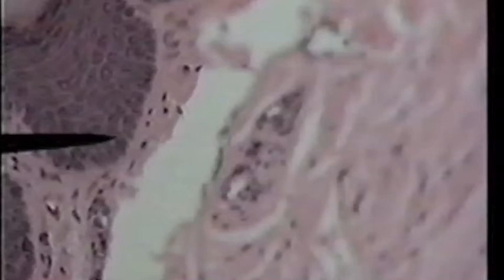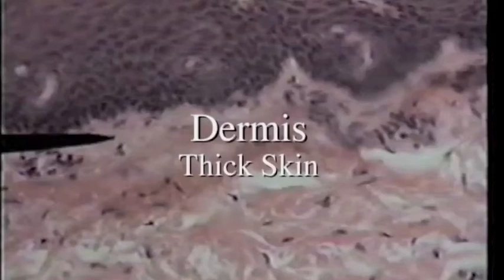These are the cells that undergo mitosis and give rise to the rest of the epidermis, all of the other layers. There are 3 living layers of the epidermis: stratum basale, stratum spinosum, stratum granulosum, and 2 dead layers of cells, stratum lucidum and stratum corneum. On high power, the tip of the pointer is in the region between the epidermis and the dermis. The epidermis is above and the dermis is below.